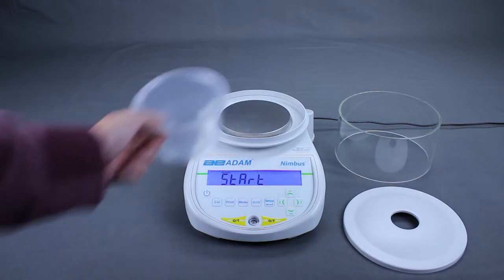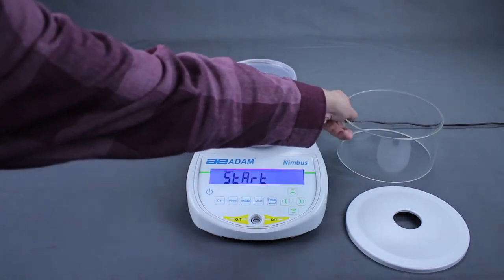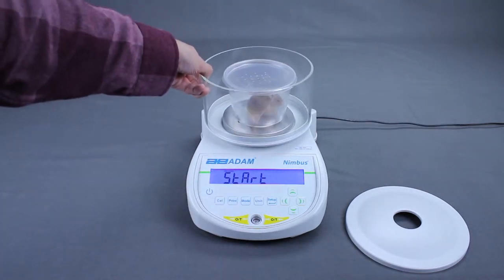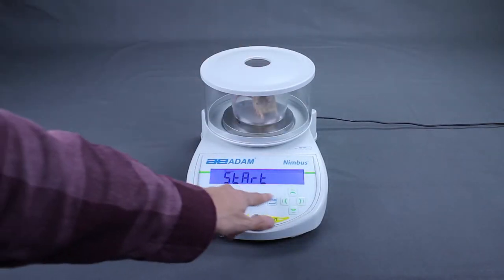If the Nimbus is set for manual mode, start will be displayed. Place the subject in the container, then press setup enter to start the weighing process.